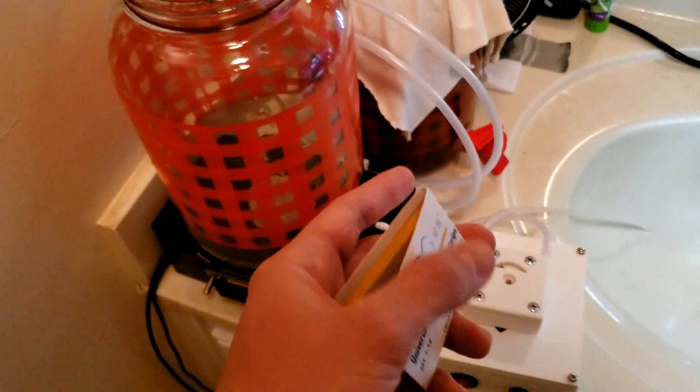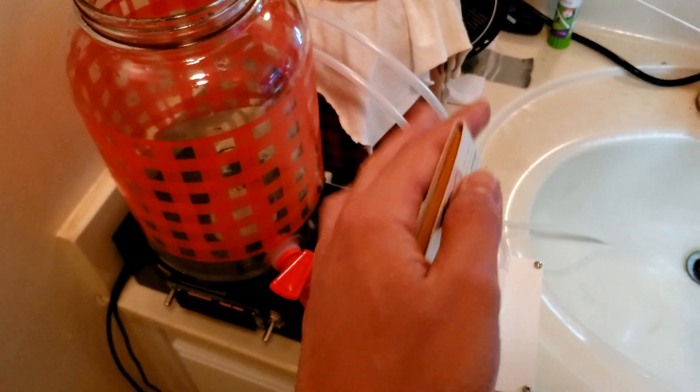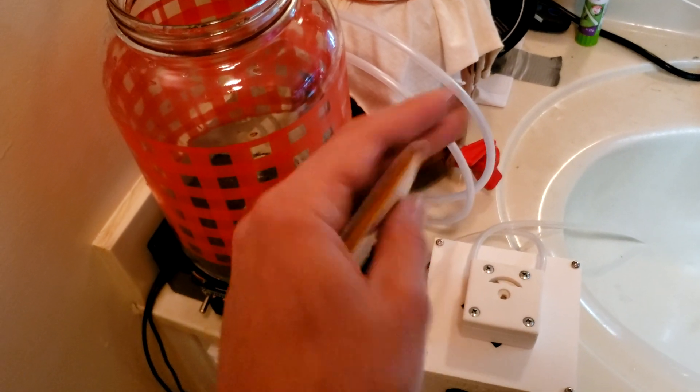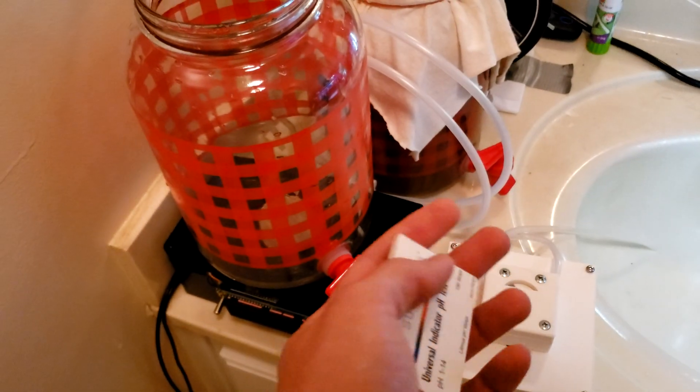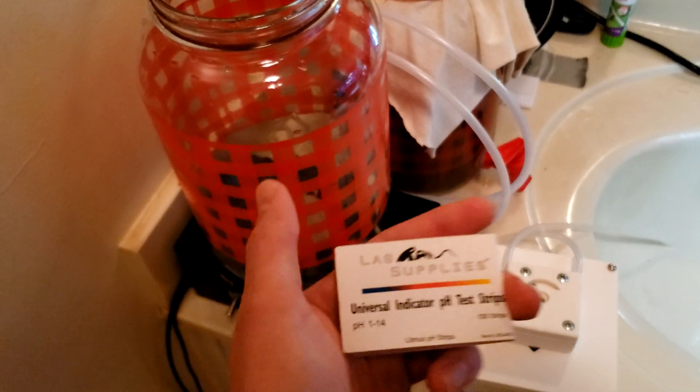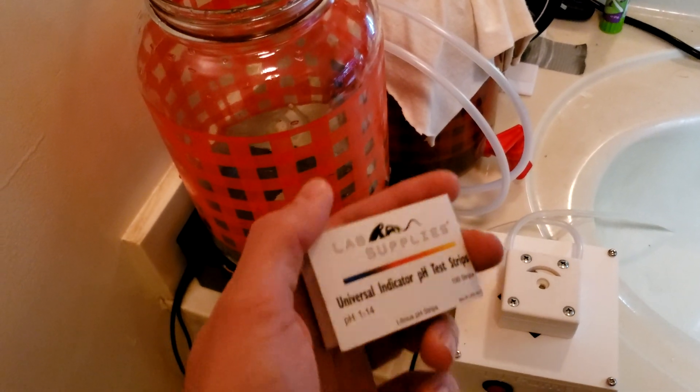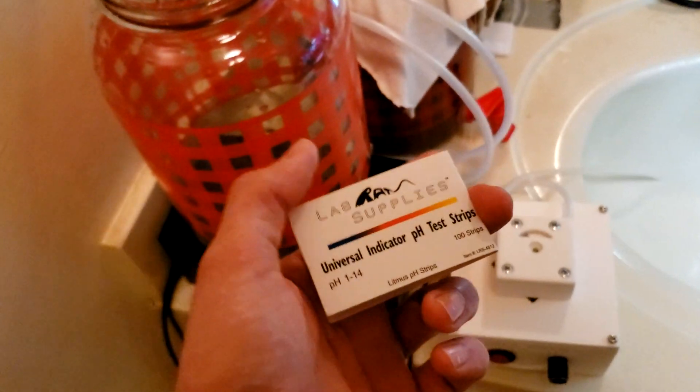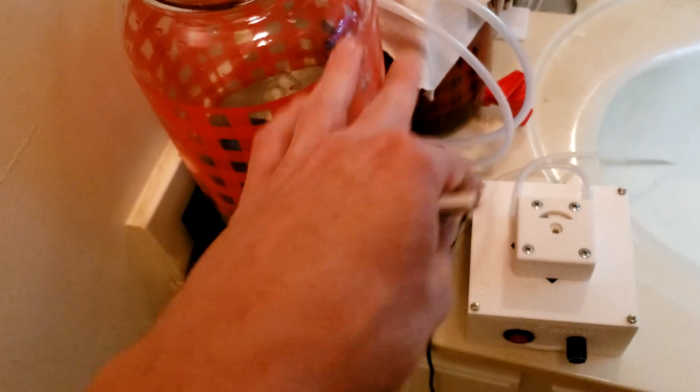So the way that we're going to measure that our DIY bioreactor is way better than the stupid way of brewing it in a little jar with a cute little cloth on top is that we're going to measure the pH. So the reason I want to use kombucha is because it's very easy to grow. It's bacteria in yeast colony, very low chance of contamination, and there is a trait of the growth rate that we can easily measure with really cheap tests.